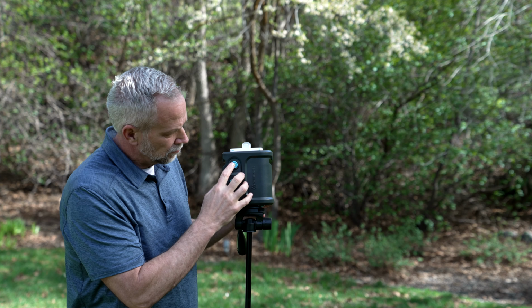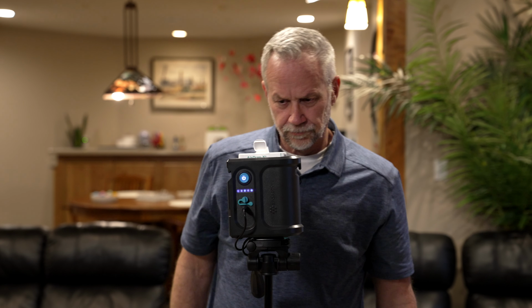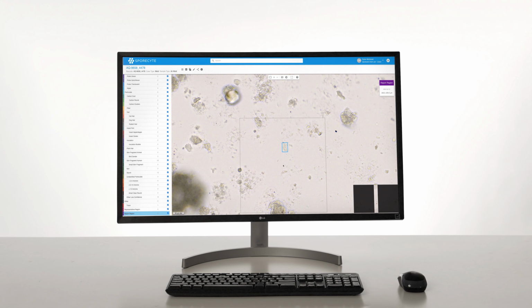From sample collection to report delivery, we're committed to providing home inspectors with accurate, comprehensive results using cutting-edge AI technology and our industry expertise.